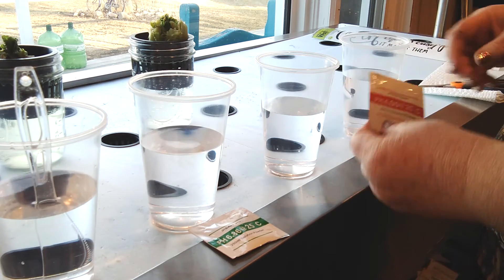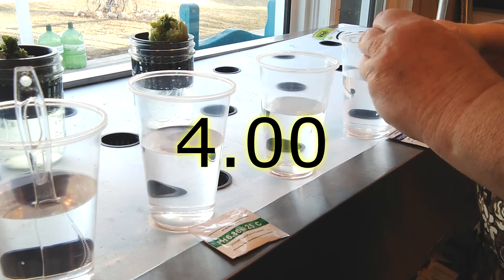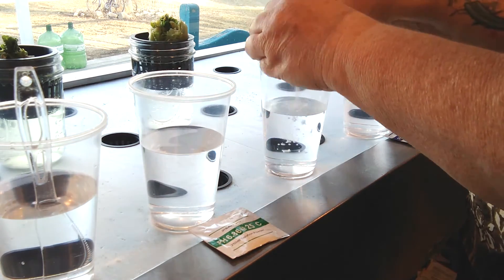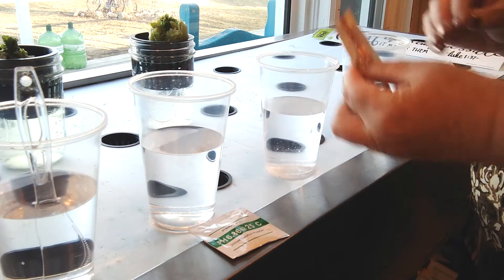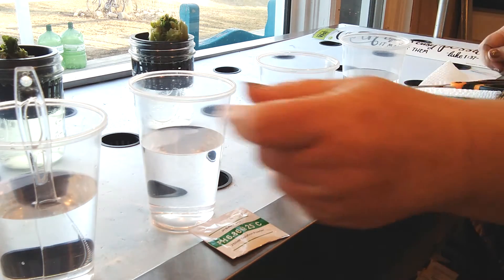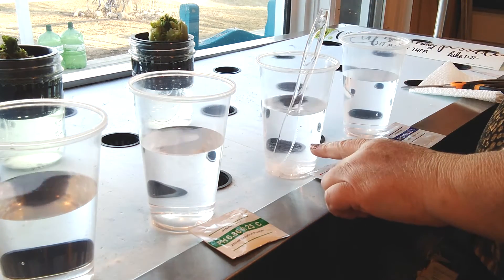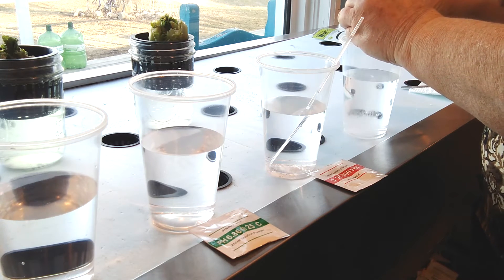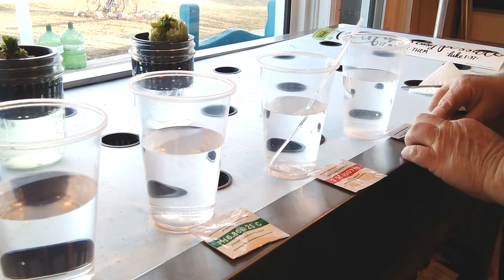It's okay if it takes a little while, but you do want to make sure it's all mixed up. Then I'm going to rinse that utensil in the clean water. Next we're going to mix our 4.0 into our distilled water. Make sure you get all of the solution in the cup and give that one a stir. While we're waiting for this one to dissolve, I'm going to go ahead and start our 9.18 in this container.